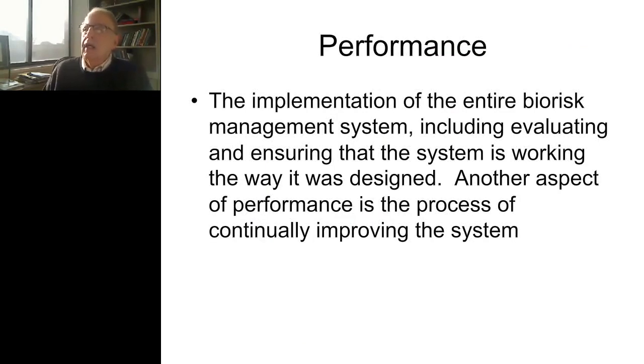So the implementation of the entire biorisk management system includes evaluating and ensuring that the system is working the way it was designed to work, and then you look at continually improving the system. So this is part of your quality management system process. And you should think of biosafety as an important component of quality management systems.